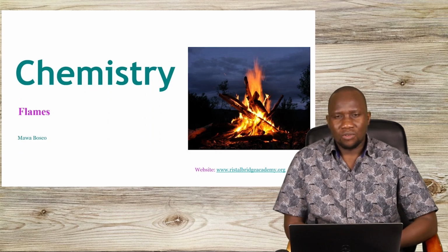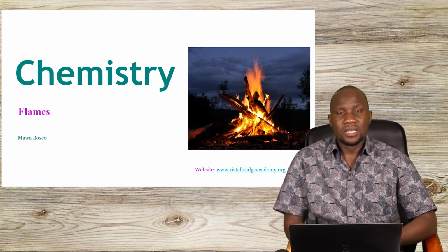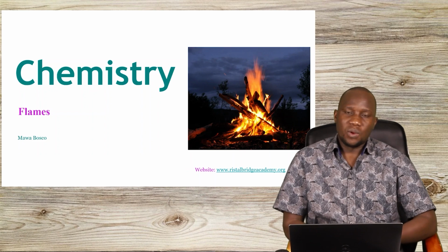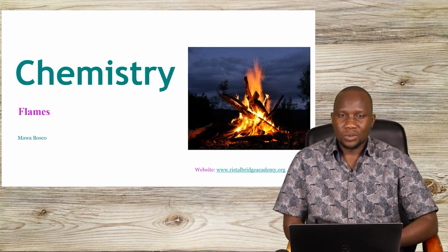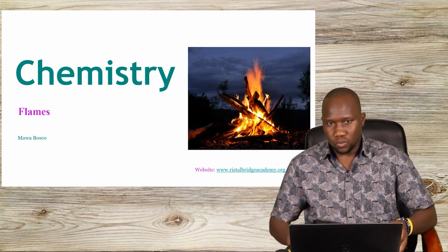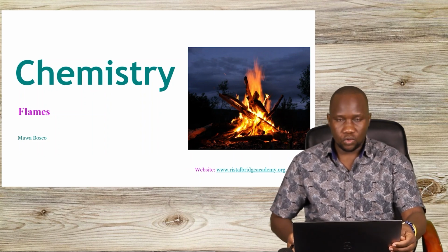But what kind of flame? What types of flames can the Bunsen burner produce? And what are the characteristics of these flames? And what do we really need to know such that we can also keep safe when working with different flames? Okay, so that is why we are having this session today.